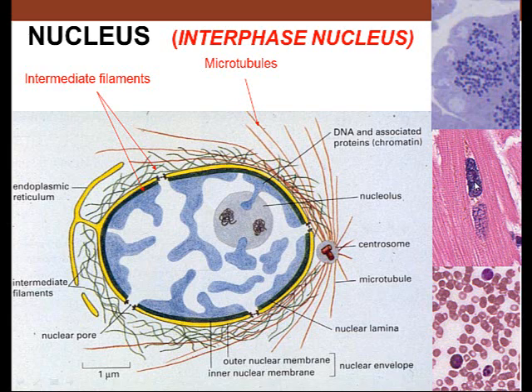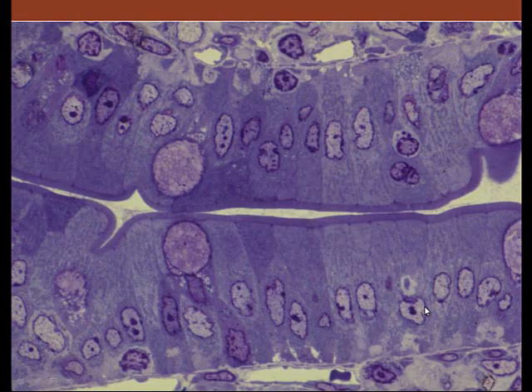There's a darker nucleus in these cells, and you can see a darker nucleus in blood too. This is a white blood cell. There's a neutrophil, an eosinophil, and a lymphocyte. So these are different cells. The cytoplasm of this lymphocyte is a little bit right there, but the nucleus is a dark structure.